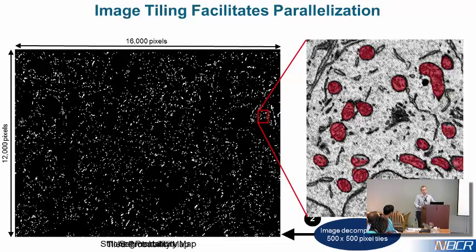Well, using iMod, as you probably know, because I know you have experience with iMod, the model files. So what I'm going to show next is how to generate what's called a model file for everyone else using iMod. This is what we use to make our training images and labels. The model files can easily scale between, say you do it on the native resolution, you want it on a bin 10, you can use that exact same model file. You don't have to recreate it to load on the downsampled image.